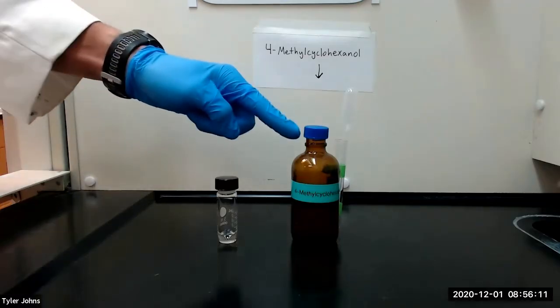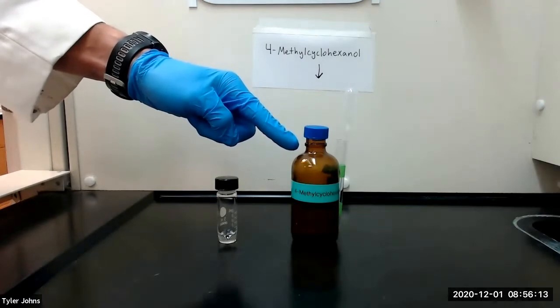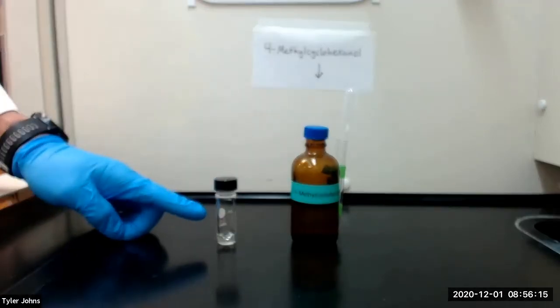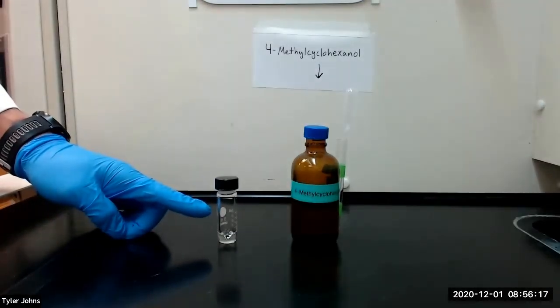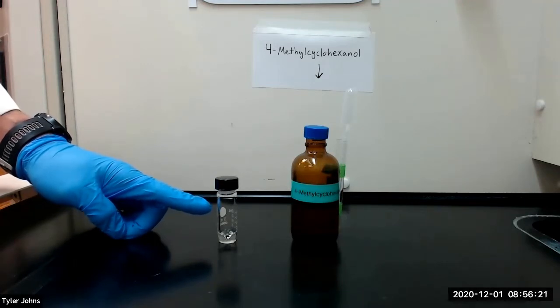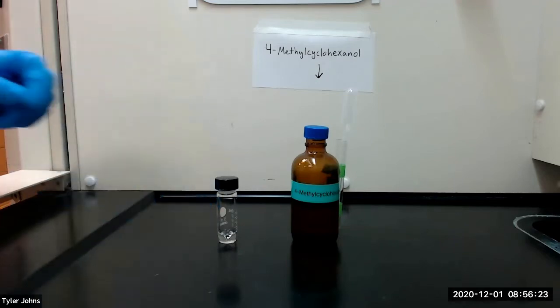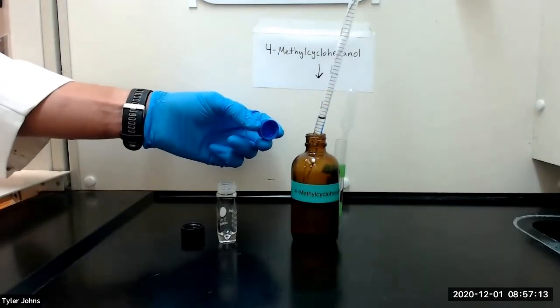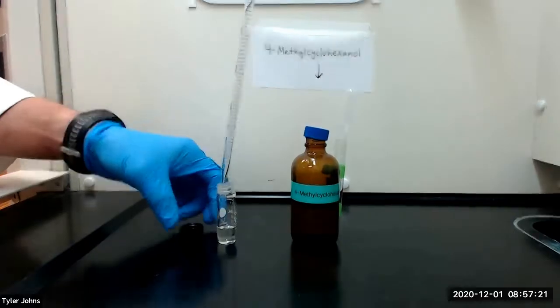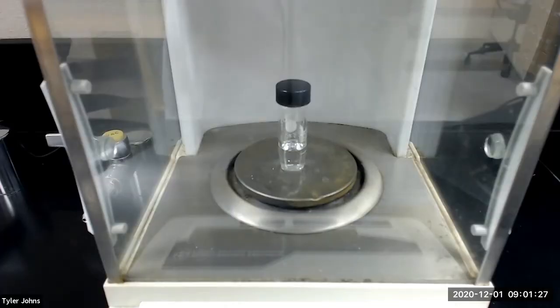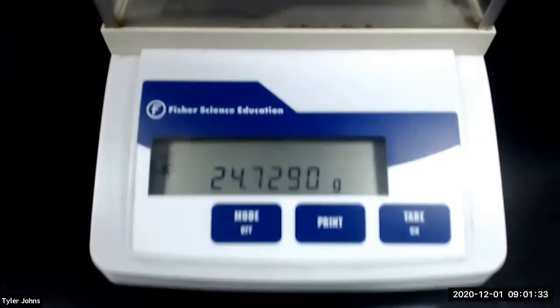We will next add 1.5 milliliters of 4-methyl cyclohexanol to the pre-weighed 5-milliliter conical vial and then re-weigh the vial to determine the exact weight of the 4-methyl cyclohexanol that we will be using. The mass of the pre-weighed 5-milliliter conical vial plus the 4-methyl cyclohexanol is 24.7290 grams.